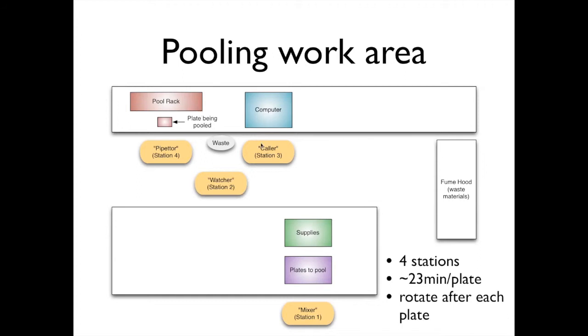We also have a position we call the caller. It's the person who sits at a computer terminal and advances a projection. So it projects down and highlights the target tubes that the pipetter has to pipette into. And there's another person who we call the watcher. The watcher does nothing but quietly watch. If there's ever a confusing moment, this person has an eye from a distance and can say this is what happened.